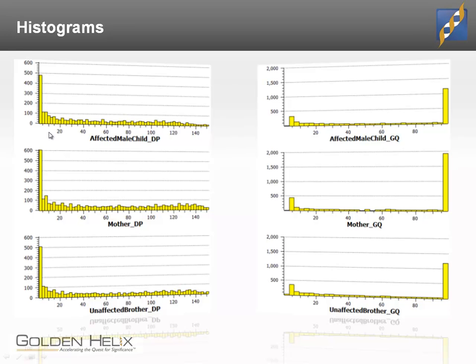continue. Now I'm going to choose, it may seem arbitrary, but again, we would expect exons that are in our exome capture to be covered quite heavily. These are starting to get into the frills of our coverage. Let's go ahead and drop things below 10. That should be a very conservative number, keeping most variants. And then on the genotype quality, we're going to drop genotypes below 20.